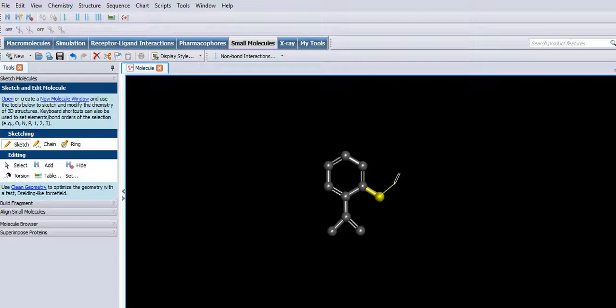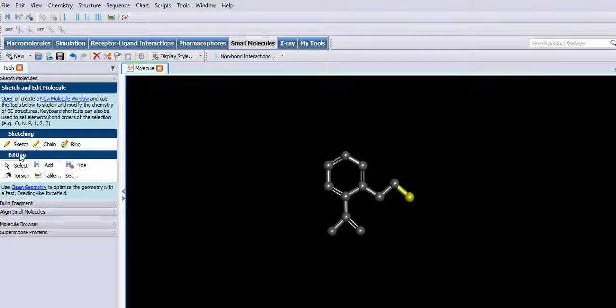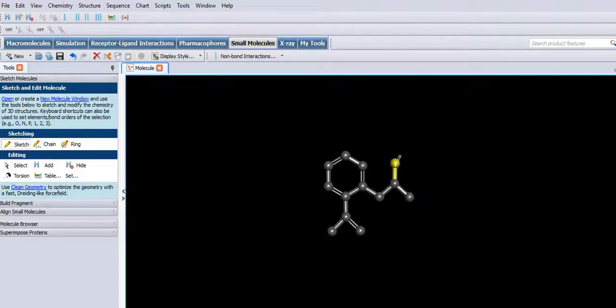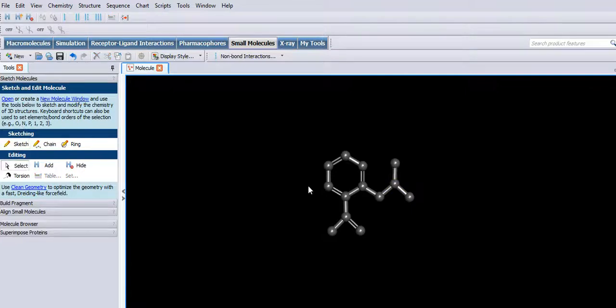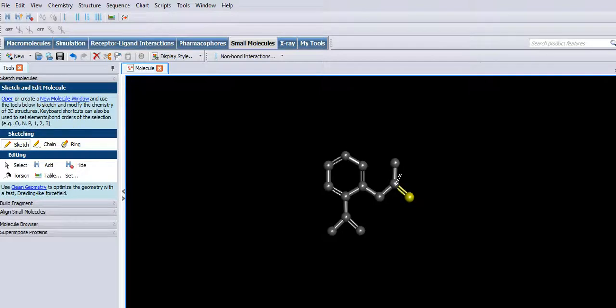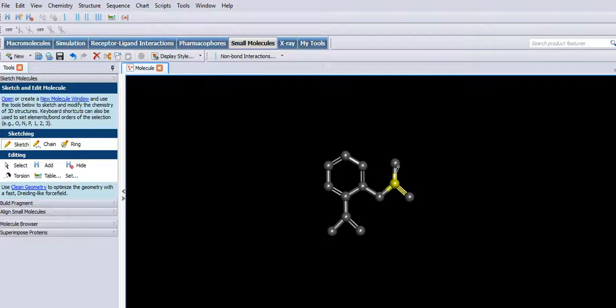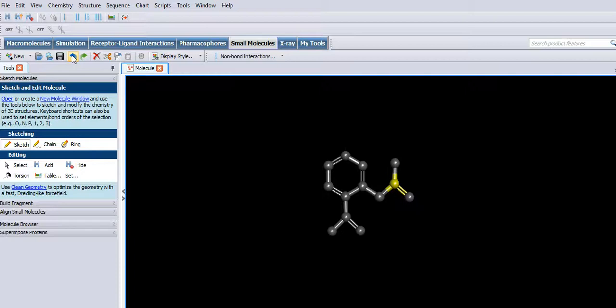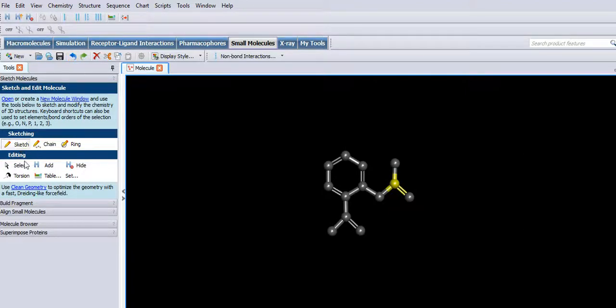So we need to convert this to double bond. That's very easy, back into sketch. If I repeated it would go to triple bond there, but you can undo that very easily using that blue back arrow there. Any mistakes, which are often frequent, just press the back, the blue back arrow.